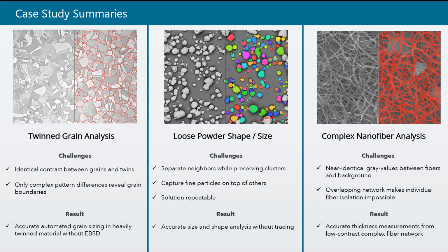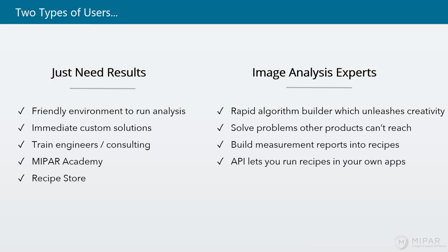So I wanted to conclude this webinar with a discussion on the various types of users that we encounter. If you are a user or researcher who is really just after the results of image analysis, but doesn't have much experience in the field, you'll find that MIPAR offers a friendly environment in which you can run the analysis algorithms, either provided by our team or downloaded from our website.